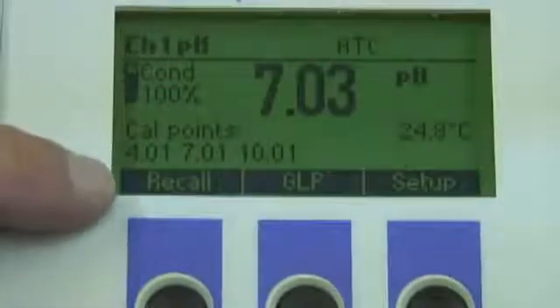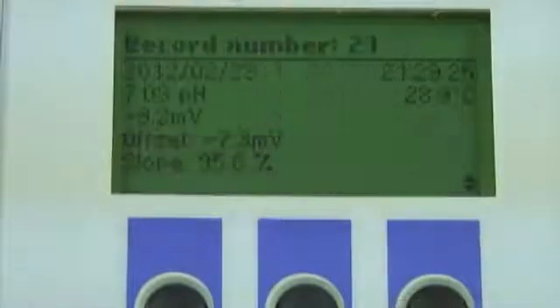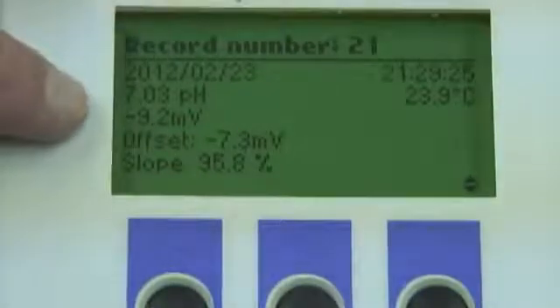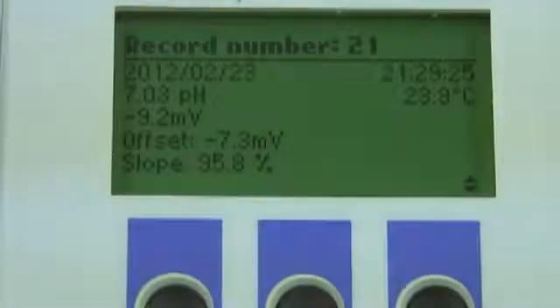Next let's hit the menu button. The virtual keys have now changed — we see the recall button, GLP, and setup. I'm going to hit the recall button and I see two options: auto log and manual log. Since my last record was done manually, I'll hit manual log. It's log number 21, which shows the pH and the date. If I hit the more button, we see record number 21 with the date, time, temperature, pH, millivolts, offset, and slope. If you want to download this information to your PC, remember this has a USB connection port in the back — simply connect the meter to your PC and download the data.